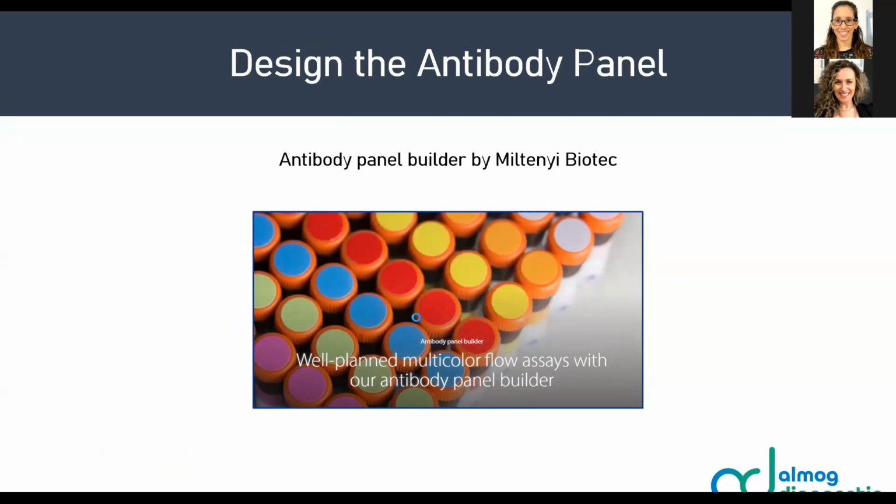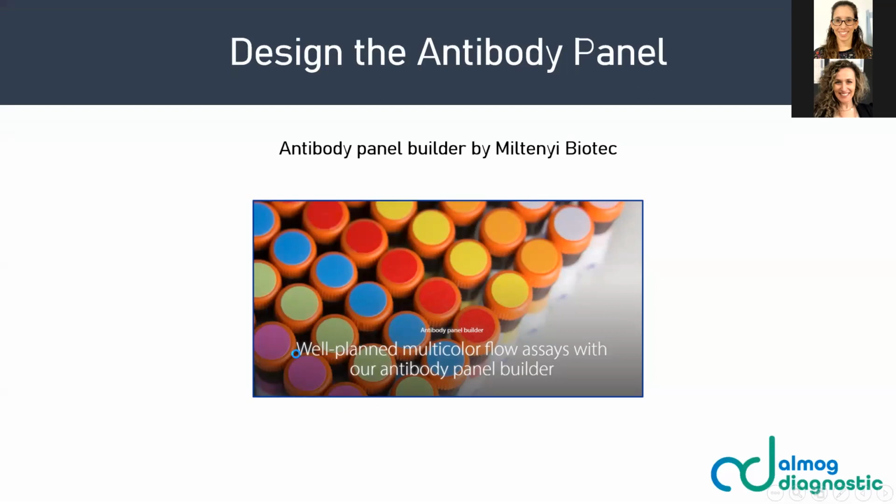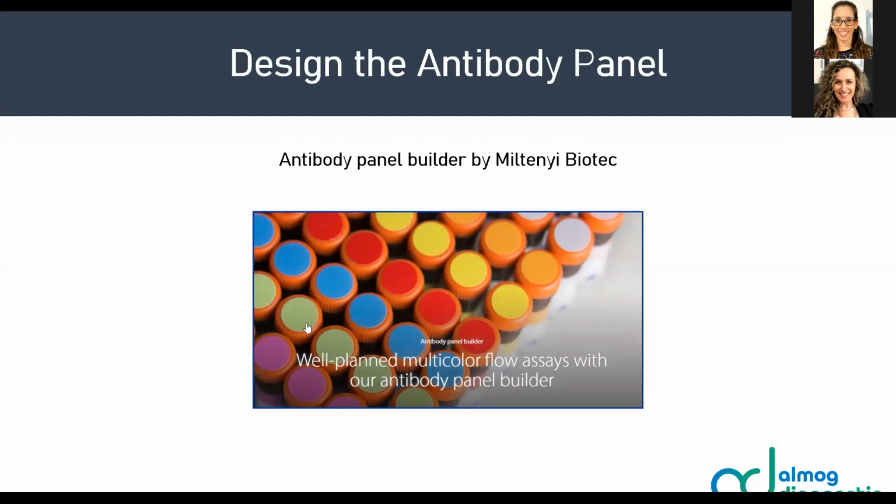So if you enter Miltenyi's website, you will get to the panel builder that looks like this, and you can type in your flow cytometer.